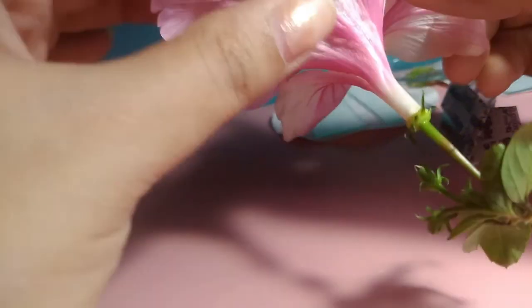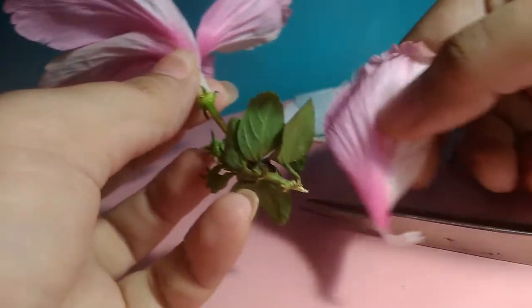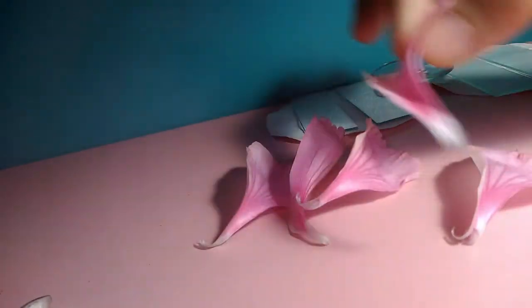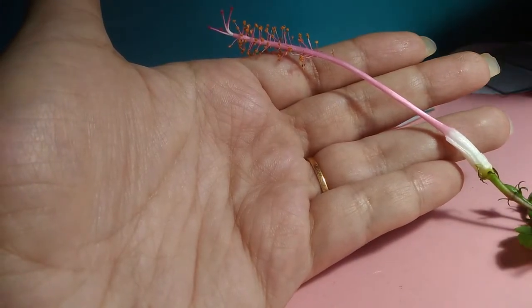First we will try to remove or separate the petals one by one. We can simply do that with our hands. Just hold at the base and gently pull out the petals one by one, just like that. And the fourth one is removed, and then the fifth one as well. So here finally we have our 5 petals. And after removing the petals, we have a structure like this.